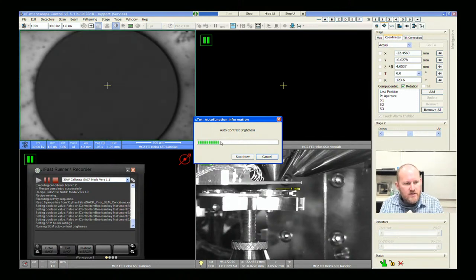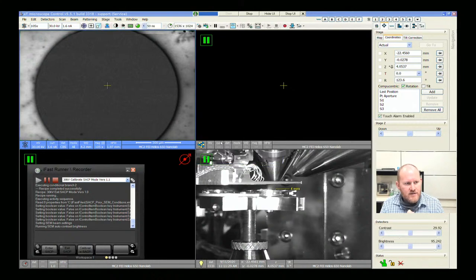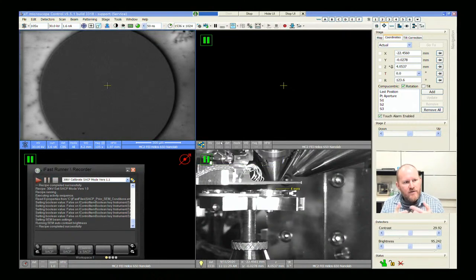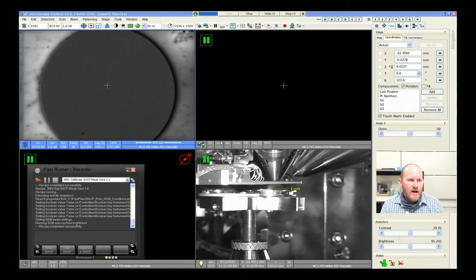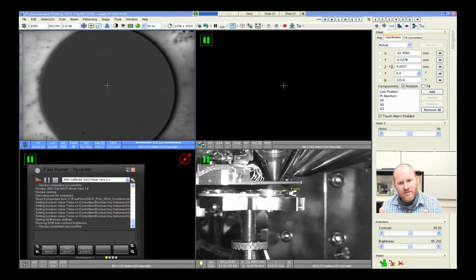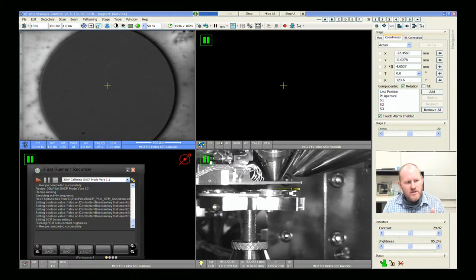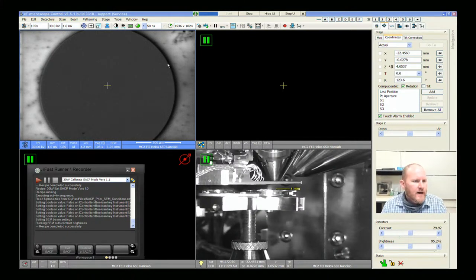The way a lot of these electron microscopes work is that for every accelerating voltage and beam current there's a long lookup table — it's kind of like an optics tree. What we're going to do is kick some lenses out of that optics tree, change their values. And then when we exit SACP mode, we just tell the system to revert back to your lookup table.